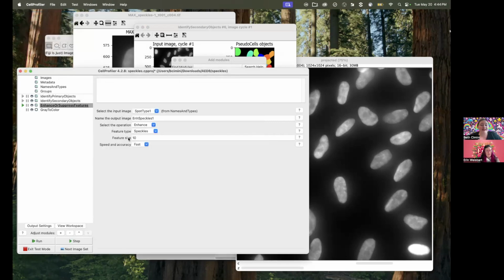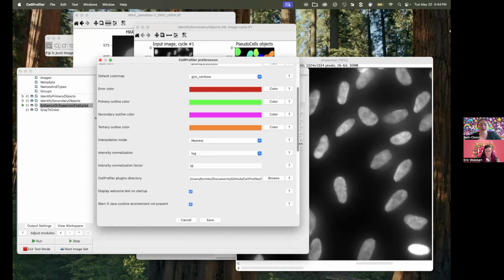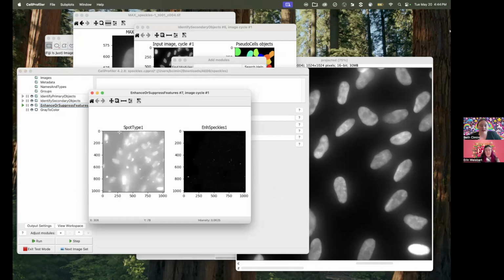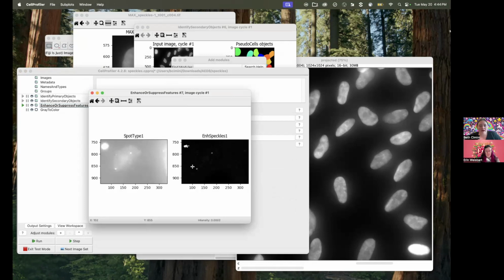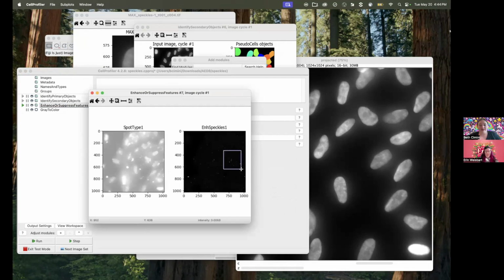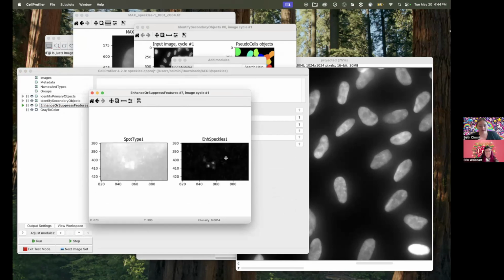It's not uncommon, at least in my workflow, to be changing my default display setting several times throughout the course of building a pipeline, and it just makes life faster. Anything that makes a step that you're going to do a bunch of times faster, like configuring things, the better your life will get. So now we can see that we have this spot that was previously on the background of a whole bunch of stuff, and now we can barely see anything because all of that background has gone away and we just have our lovely little spot. It looks like we now don't have anything, but in fact we do have things. We just mostly have lovely little spots.